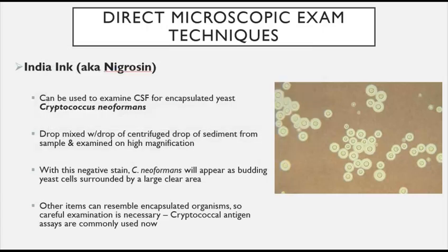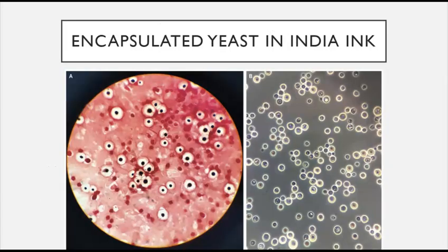With India ink examinations, be careful because other items can resemble encapsulated organisms. A lot of times we use cryptococcal antigen assays for testing now instead of the India ink. Here are some other examples of encapsulated yeast in India ink.